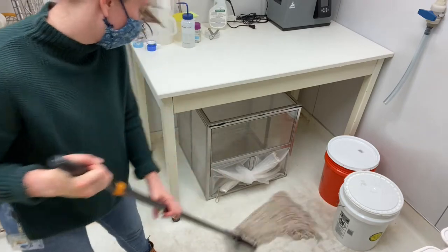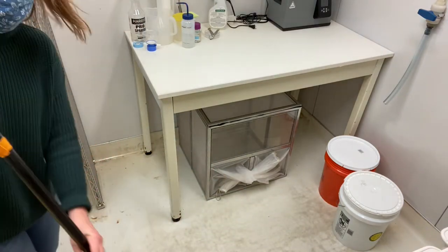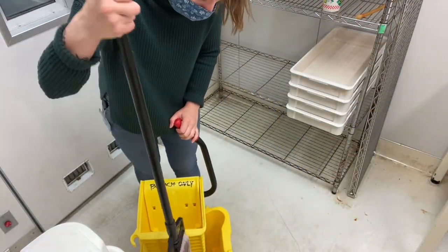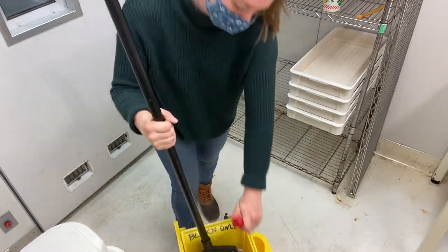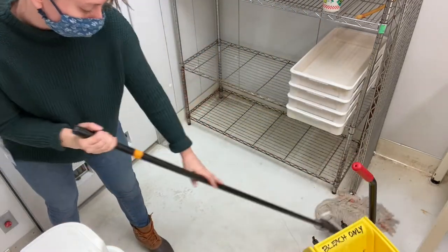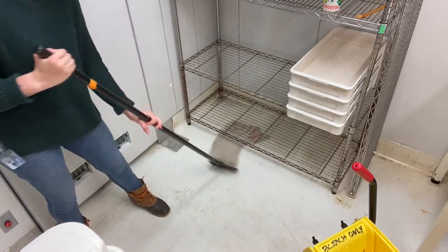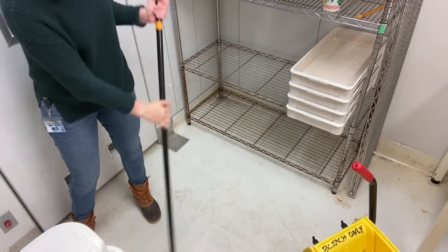I just spilled some water with the bucket, but that's okay because we're already mopping. Like I said, I stop at this line and get fresh water. Now for the back half of the confiron — make sure you get under the shelves as much as possible because we only move them to clean once every six months, so they can get kind of dirty.